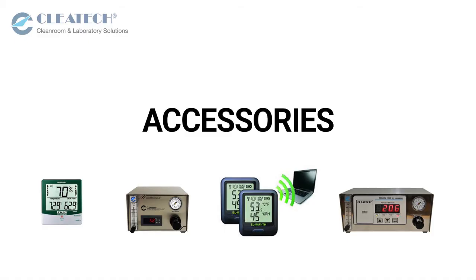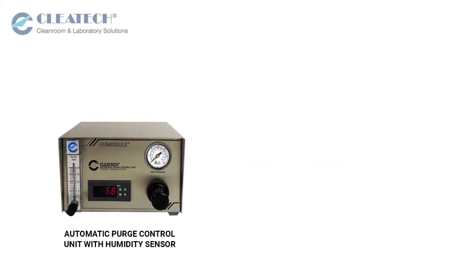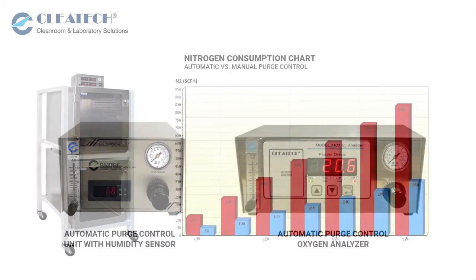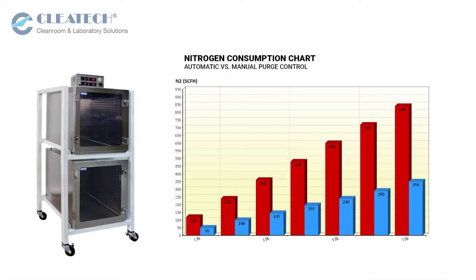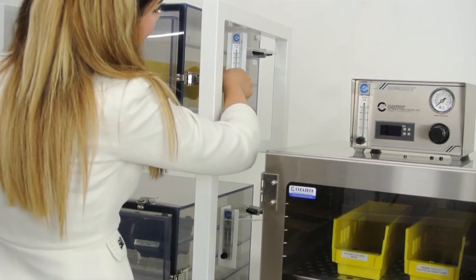Clitec offers a wide range of accessories such as a digital hygrometer, thermometer, and data logger with Wi-Fi capability. A nitrogen purge control unit with humidity or oxygen sensor allows you to reduce up to 75% of nitrogen consumption by actively controlling and monitoring moisture and oxygen levels. A flow meter is also available to manually control the nitrogen flow.